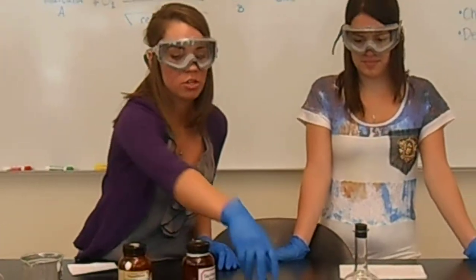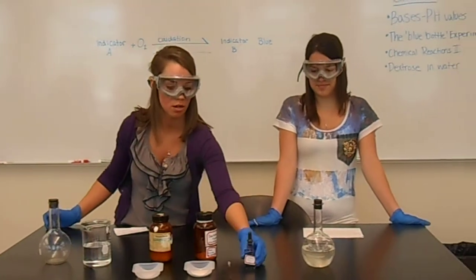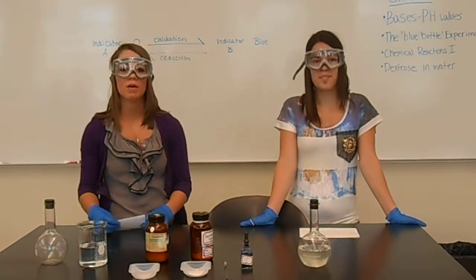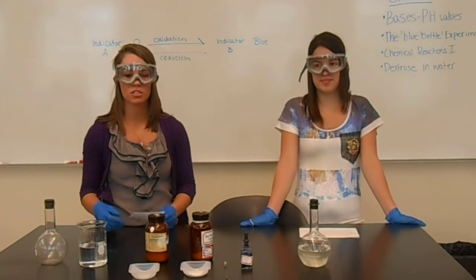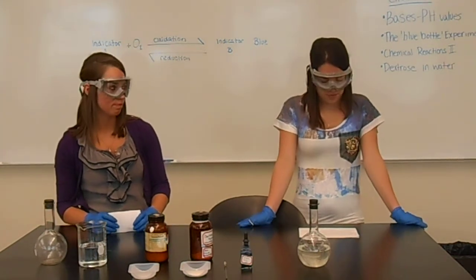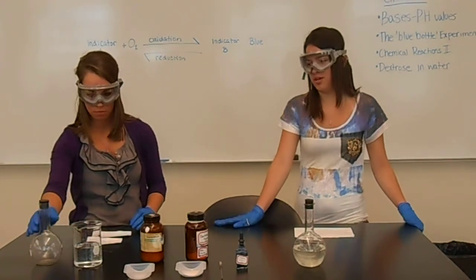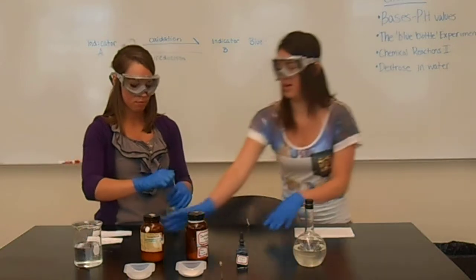And then you're going to use six to eight drops of the methylene blue indicator. Since we're using acids and bases, it's best advice to use gloves and also goggles. We're going to start by dissolving 8 grams of potassium hydroxide into 300 milliliters of the distilled water.